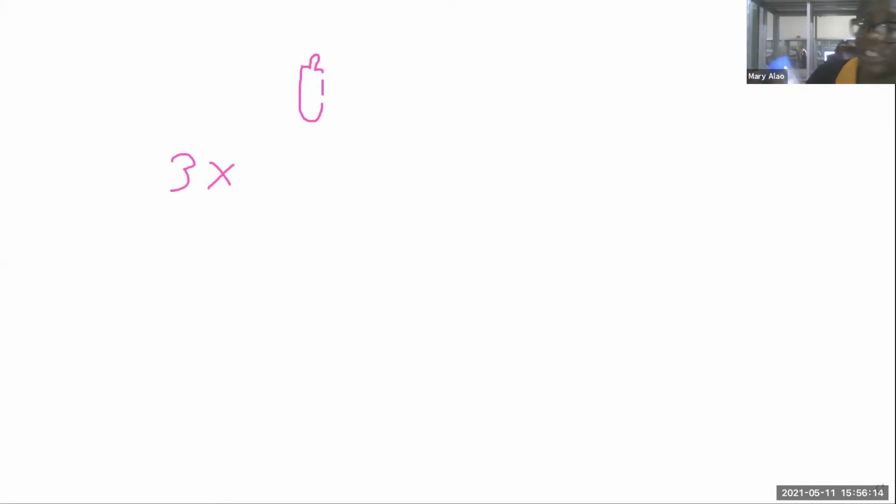I'm really confused. Is it the second solution? Yes, that is the second solution. Oh, okay. As you can see, mine didn't react. It didn't react at all? Yes, no reaction.